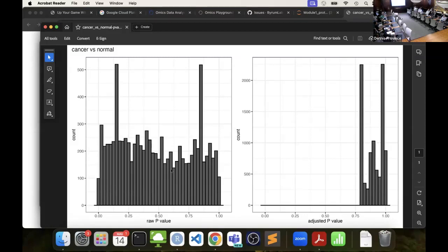In this particular example, it has to do with the clinical factor in the samples that's not included in the model. And if I were to include that factor into the model, this would probably look a lot better. So yeah, sometimes we don't get all the information up front. And if we look at this, I can go back in a post consult and say, what else is going on with these samples? And get a little more information and see if we can add that all in.